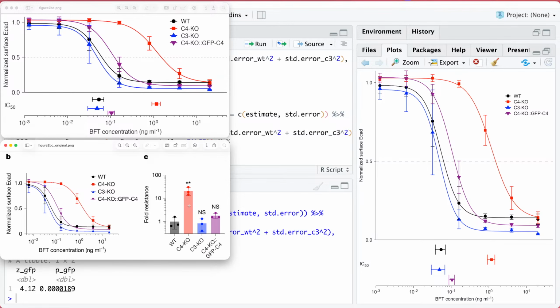and then do some type of comparison of those estimates with the standard error versus what they did here, right? I don't think the results change. The story doesn't change, but I think the interpretation is a bit more precise like this. I also think more closely linking the IC50 values with their variation to these dose response curves is just an easier way to interpret the data.